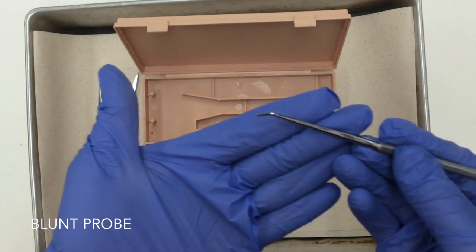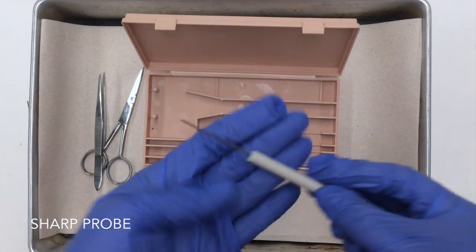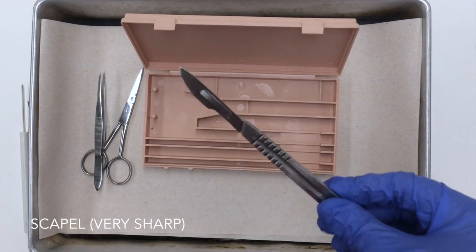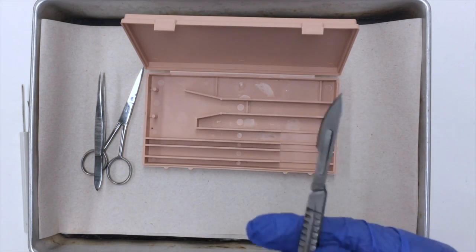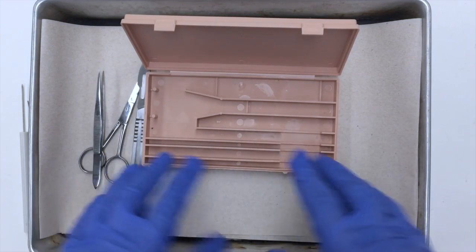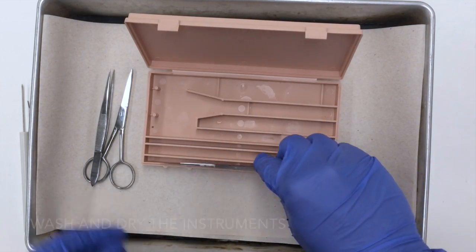A blunt probe, a sharp probe, and of course the very sharp scalpel. Be extremely careful because some of these scalpel blades are brand new.